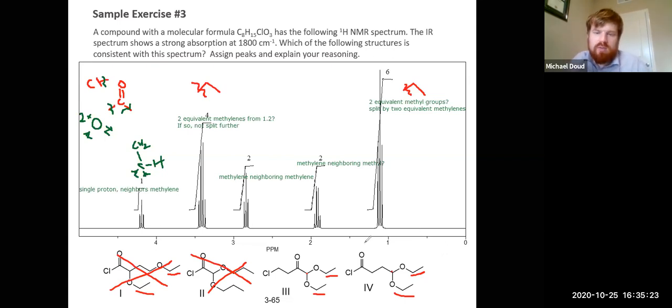Okay, now the next thing I want to look at is this hydrogen here, and this hydrogen here. We see that one at about 4.2 down here. This 4.2 peak is split into a triplet, more or less. It might be complicated, but it kind of just looks like a triplet to me. This is a really low resolution NMR, so it's hard to tell anyway. What that would suggest is it's split by a neighboring methylene group.